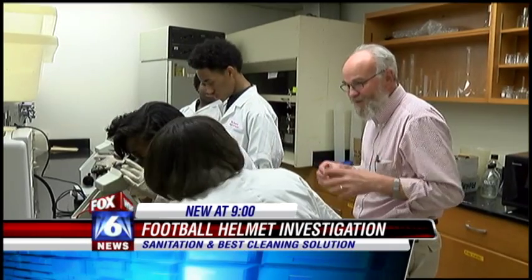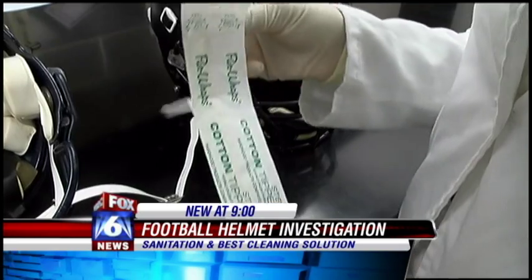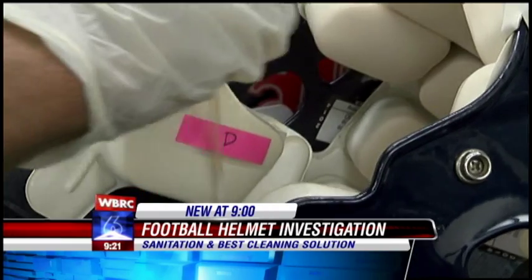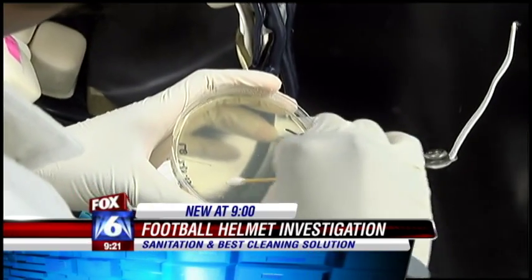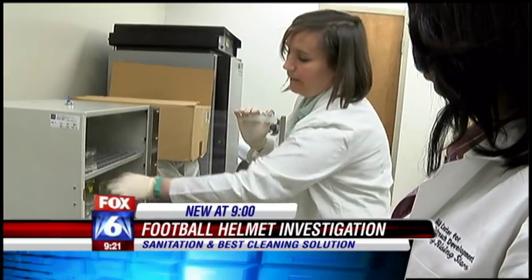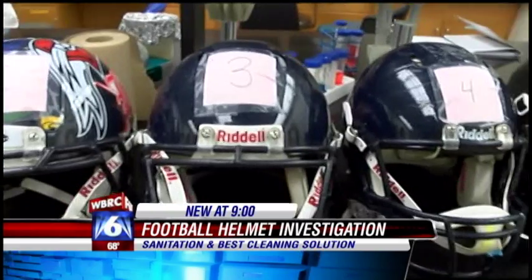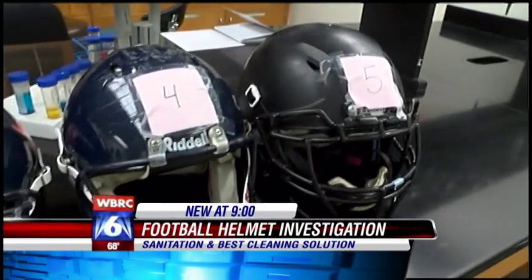To figure out, we visited the UAB School of Math and Science. Scientists swab four parts of each helmet: the chin strap, the back of the head, the face mask, and the ear padding. When we just swab the helmets, we're growing everything that's on there, which is then incubated for 24 to 48 hours. And to get the most accurate results, we used helmets that hadn't been worn or cleaned since the season ended.